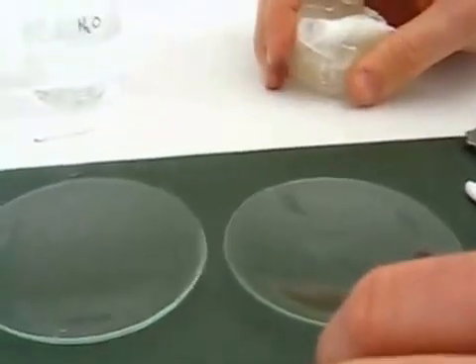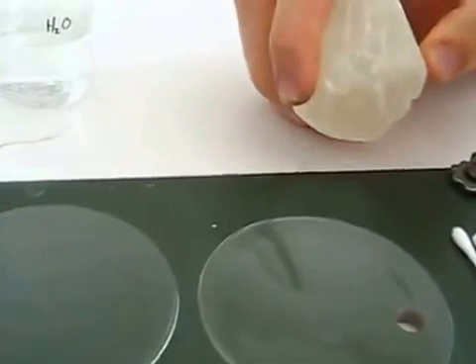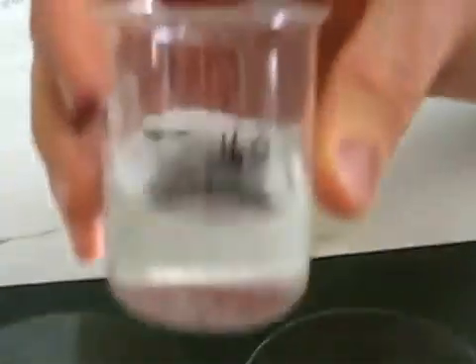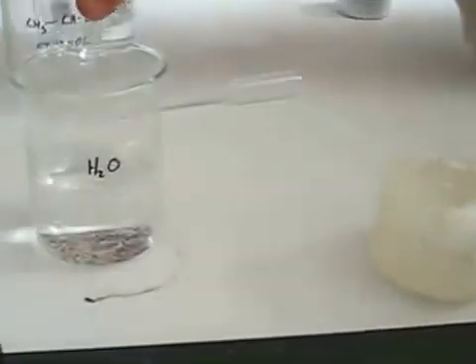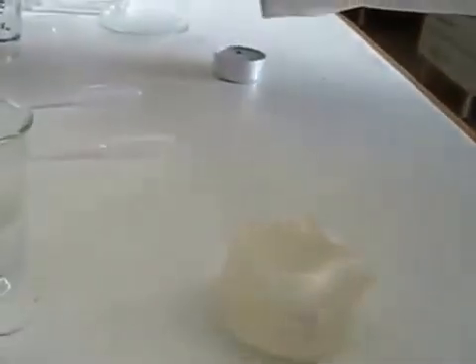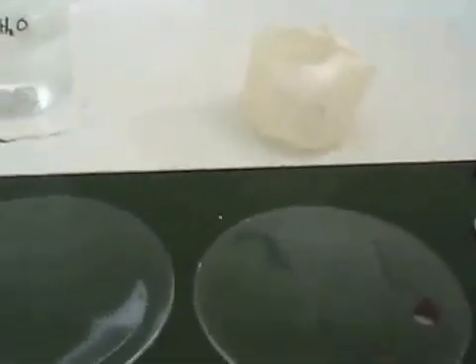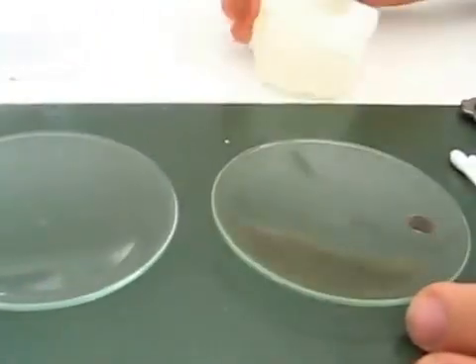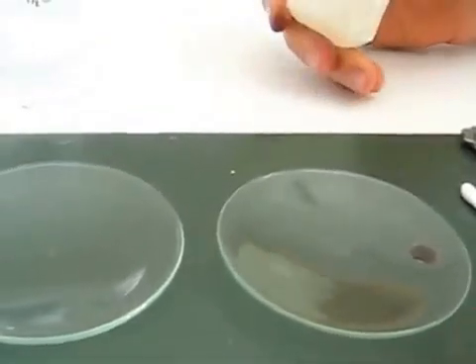Hello. Today we're going to talk about the solubility of wax, paraffin wax, in various solvents. Now these solvents that we're using today are water, ethanol, acetone, and cyclohexane. So this experiment is looking at the solubility depending on the polarity of the solvent.